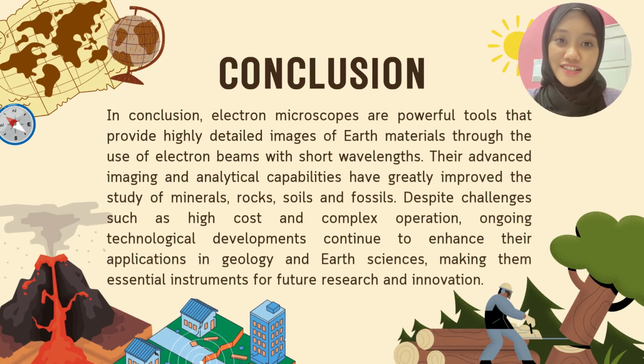Based on our discussions, we can conclude electron microscopes are powerful tools that provide highly detailed images of Earth materials through the use of electron beams with short wavelengths. Their advanced imaging and analytical abilities have greatly improved the study of minerals, rocks, soils, and fossils. Despite challenges such as high cost and complex operation, ongoing technological developments continue to enhance their application in geology and earth sciences, making them essential instruments for future research and innovation.